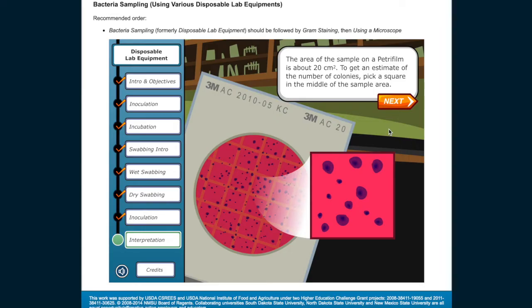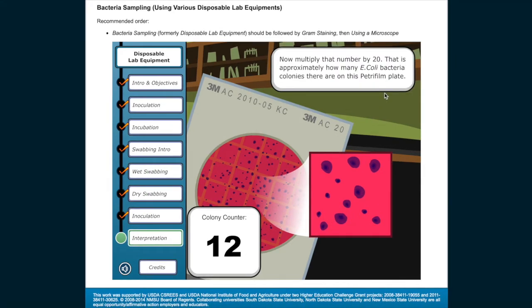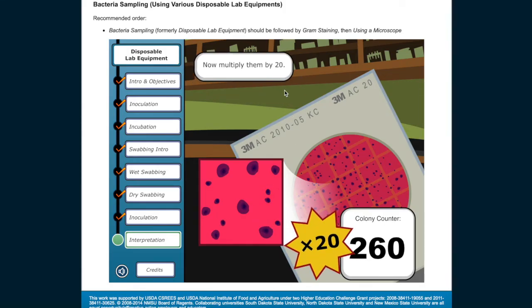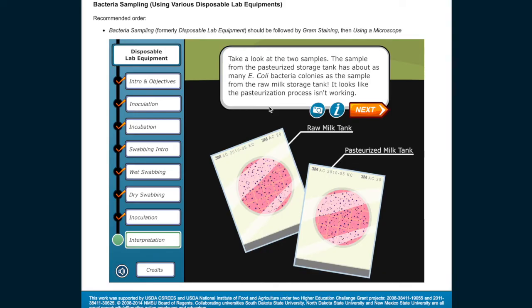The area of the sample on a Petri film is about 20 centimeters squared. To get an estimate of the number of colonies, pick a square in the middle of the sample area and count the number of colonies in the highlighted square, then multiply that number by 20 — that is approximately how many E. coli bacteria colonies there are on the plate. Now let's look at the sample from the pasteurized storage tank. Count the colonies in the highlighted square and multiply by 20. The sample from the pasteurized storage tank has about as many E. coli bacteria colonies as the sample from the raw milk storage tank — it looks like the pasteurization process isn't working.